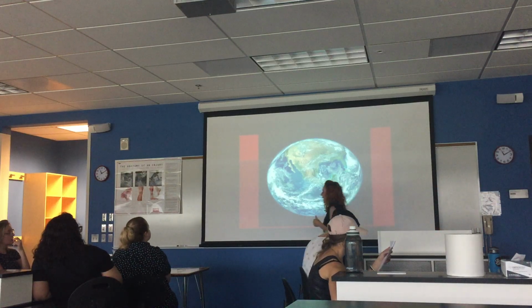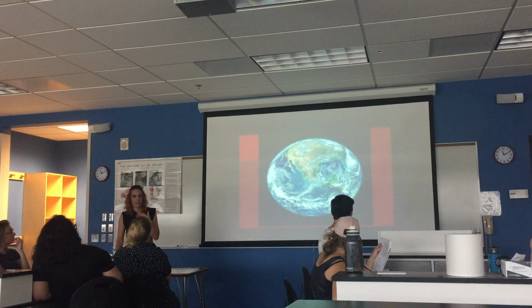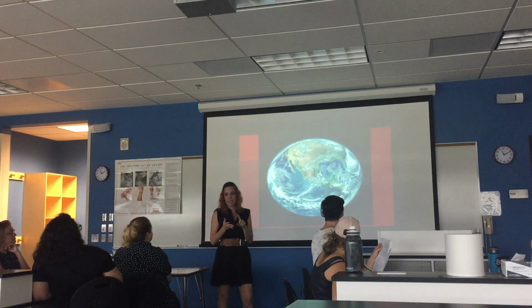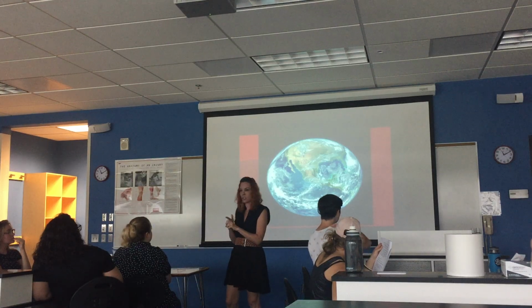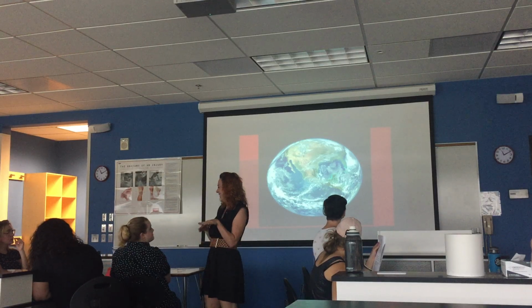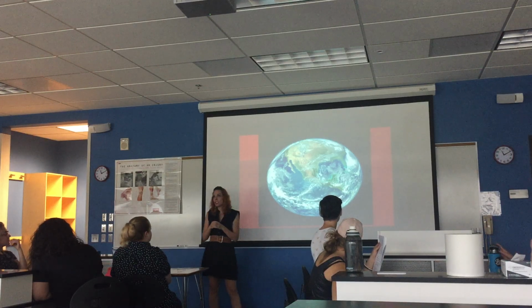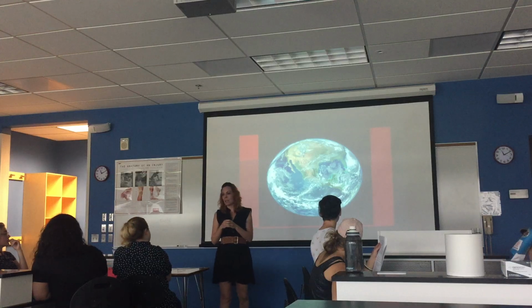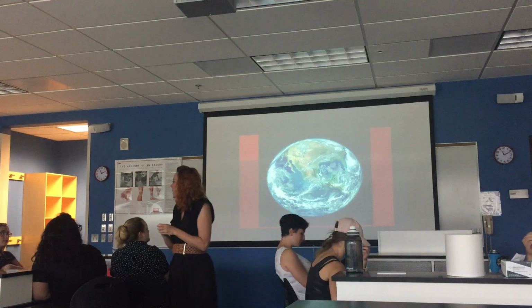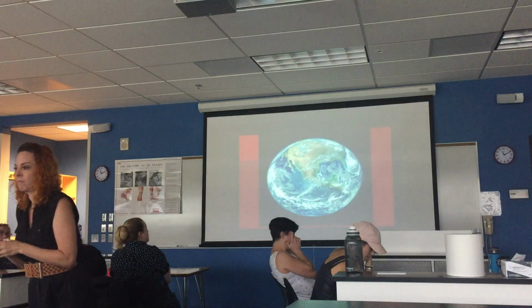All right, so this is my analogy for how I try to teach students to look at things under the microscope. So we have the 4x, the 10x, and the 40x powers, right? And I just told you we're not going to use 100x because we don't really need it, and it's oily. Okay. So imagine you're in anatomy class, right? And I'm telling you to go find the goblet cell or the chondrocyte in the cartilage tissue, right? So the analogy would be, I am asking you to go find a tree in the forest, right?